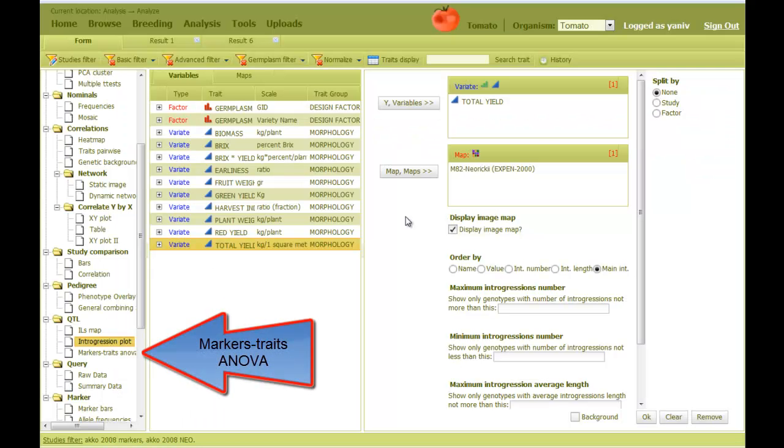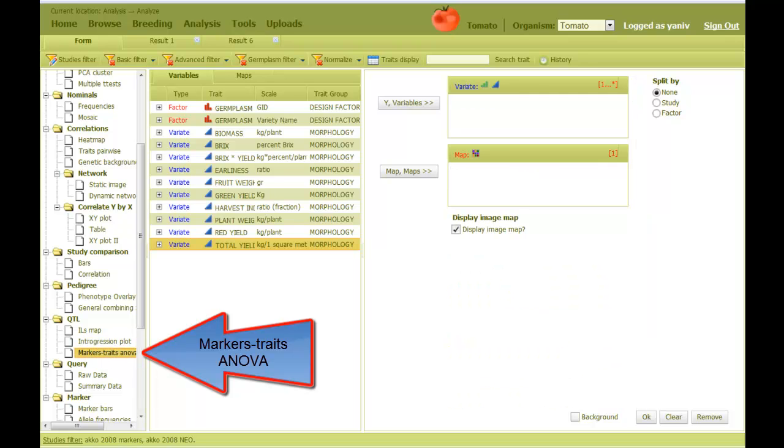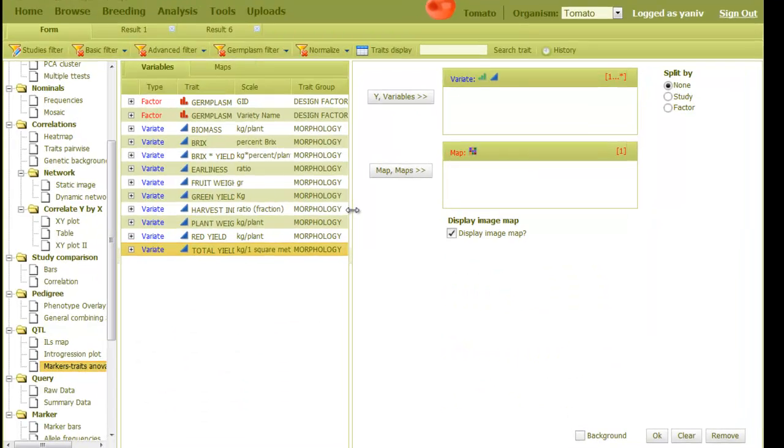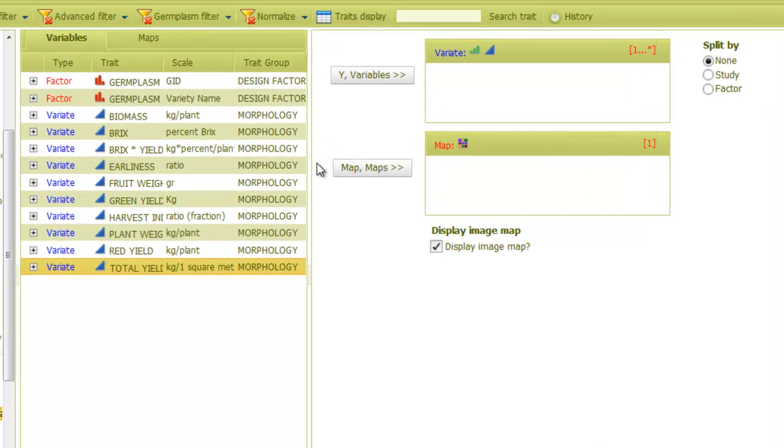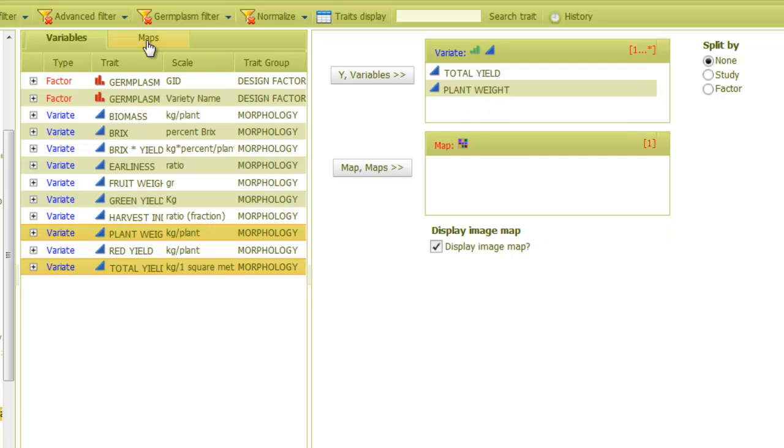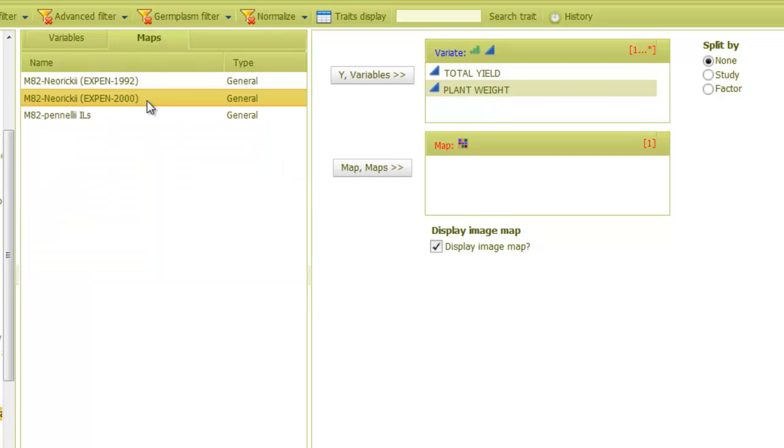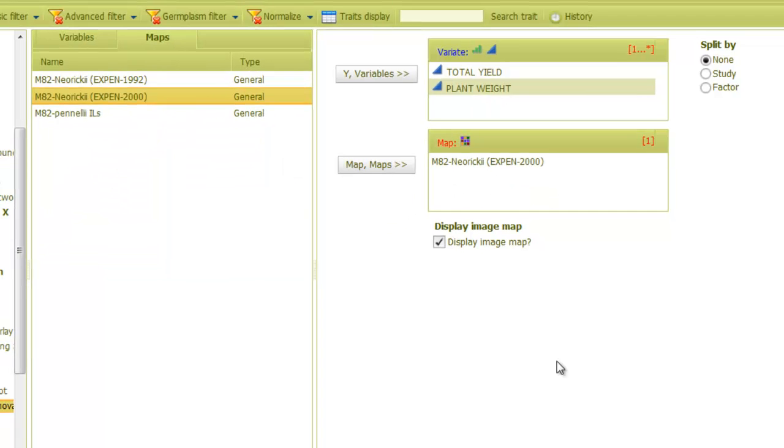As another option, I can select the markers trait ANOVA, and again put one or more traits in the Y field. Let's put these ones, and then the map in the next field.